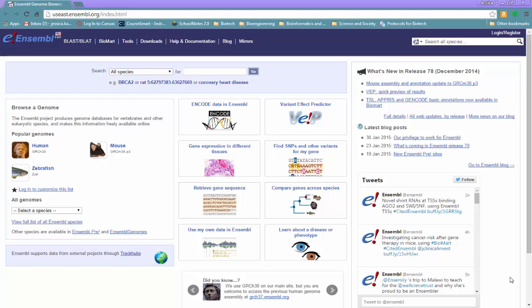In the last video, you saw how information for bioinformatics is organized on the NCBI tool. I want to go through a really similar process to show you on Ensembl how to navigate the website and help you to understand the way that information is logically organized.